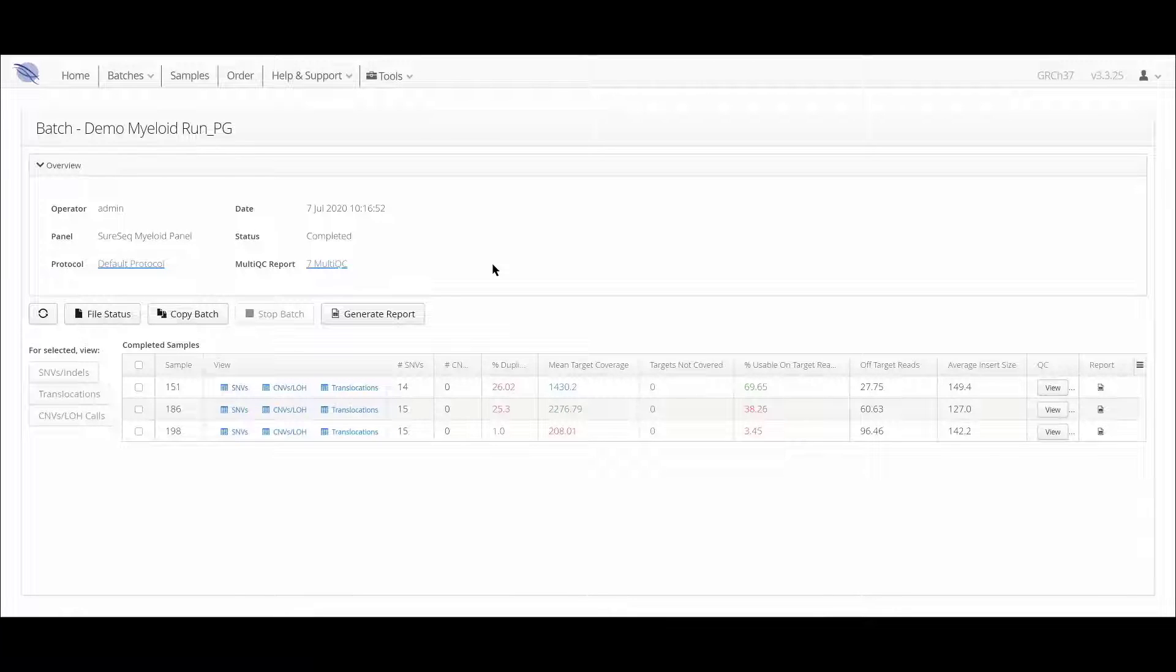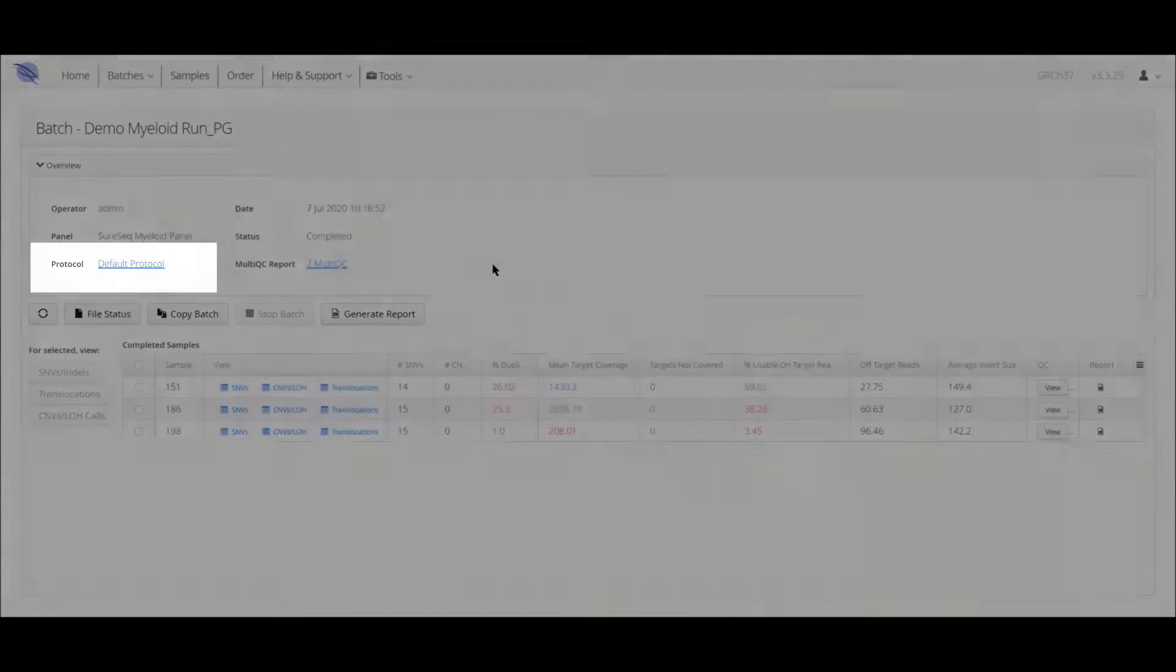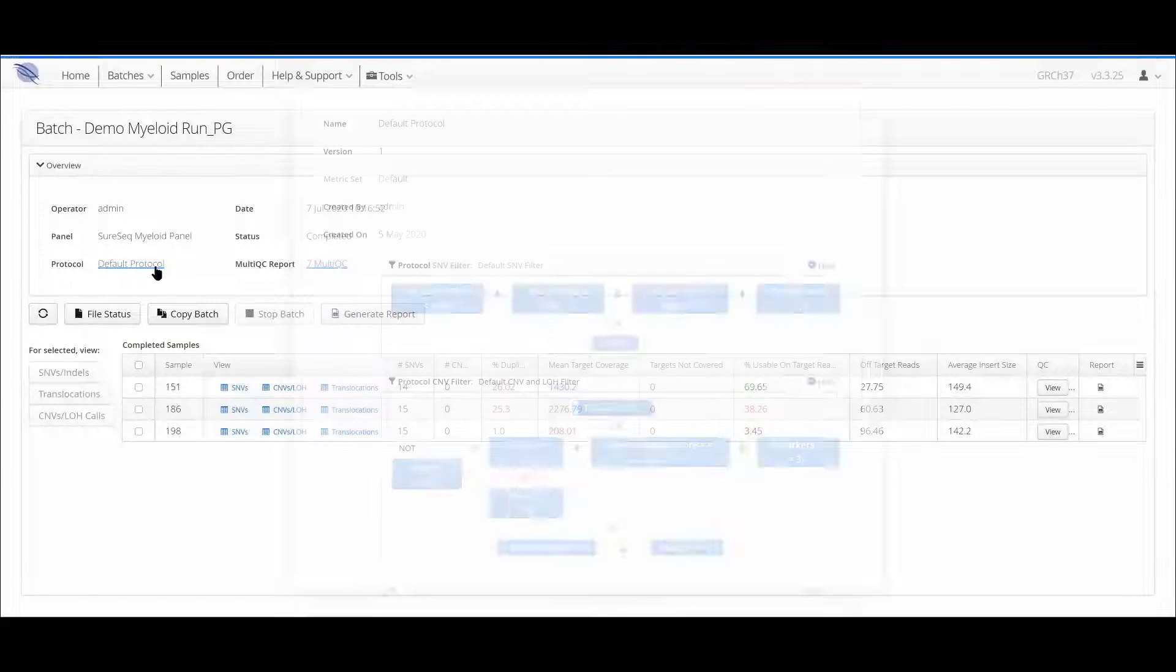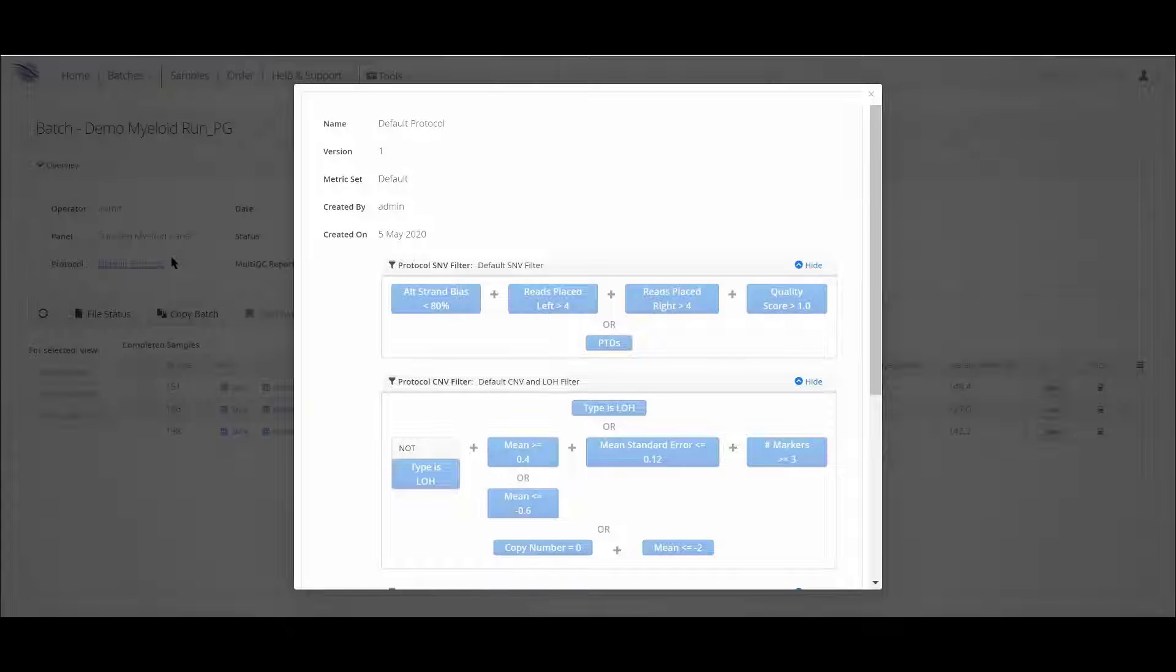To see which metric set is being used, just click on the analysis protocol link and it will be displayed at the top of the window. The software provides the user with the option to view the individual conditions within a metric set or they could create their own metric set and assign it to a protocol.